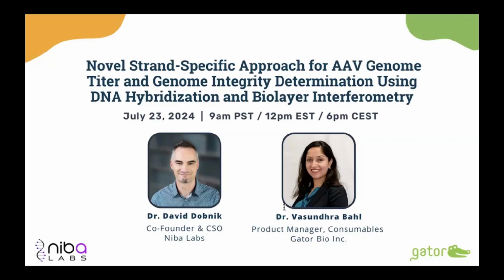Thank you. And this looks like a question for David. What would be the best choice for standard curve material? Well, as I've already said before, in my view, it would of course be some controlled material. But on the other hand, if you have a material for the standard curve that is not the same as your testing material, you might have some bias.